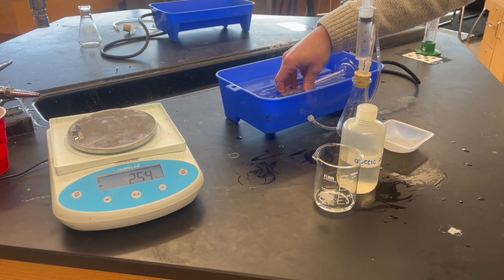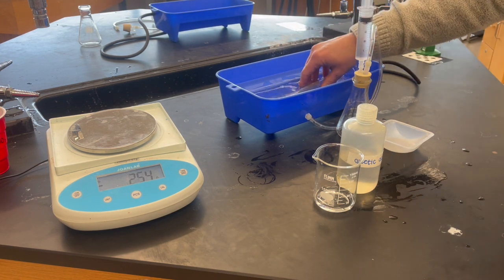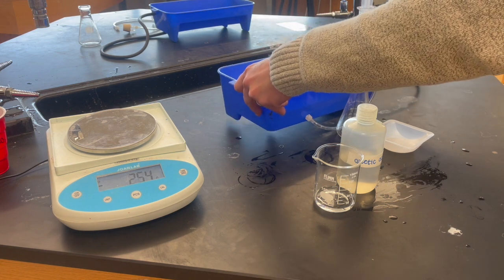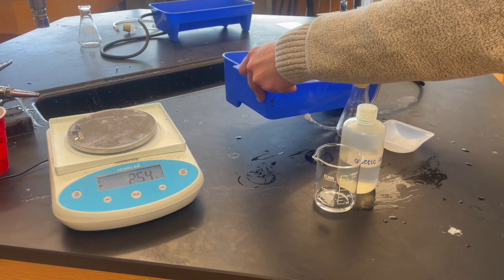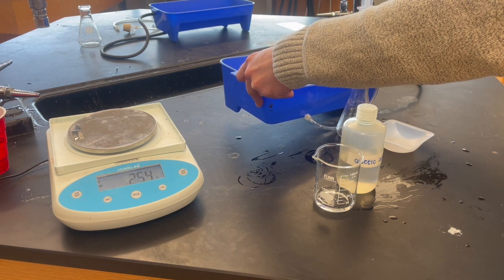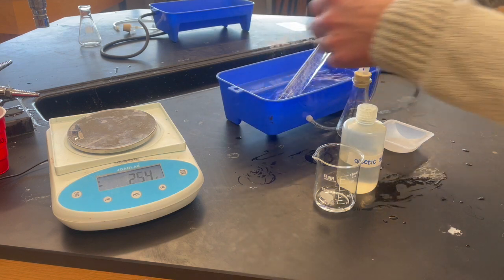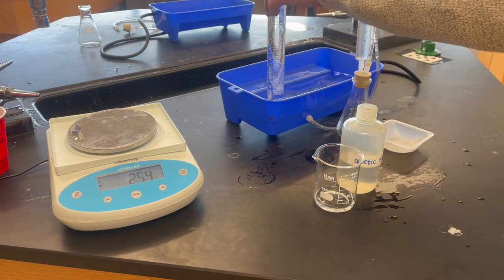Next I take the graduated cylinder and completely fill it all the way up to the top with water, and then I'm going to invert it upside down so that I can collect the gas that is escaping from the reaction between vinegar and baking soda.